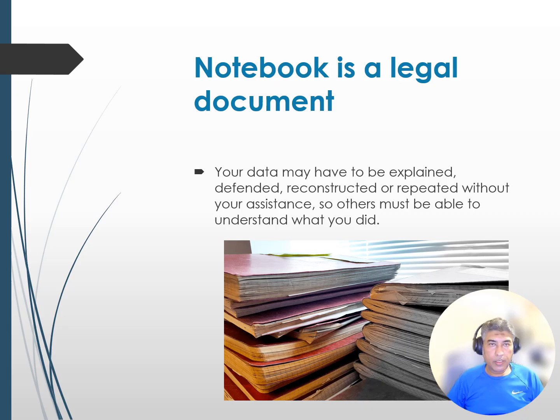The laboratory notebook is a legal document. Your data may have to be explained, defended, reconstructed, or repeated without your assistance, so others must be able to understand what you did during your experimental work or research studies.